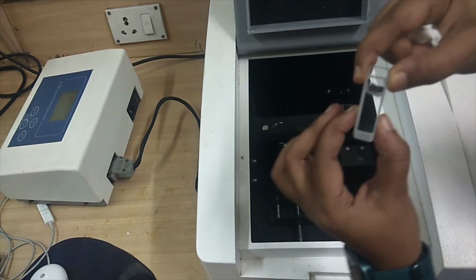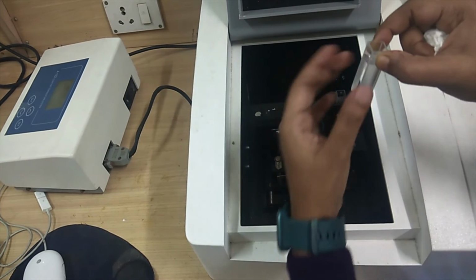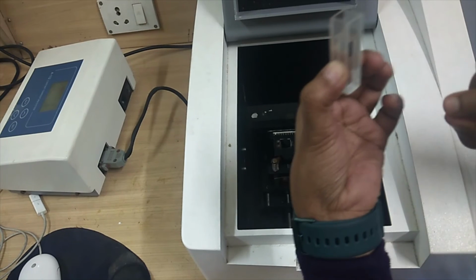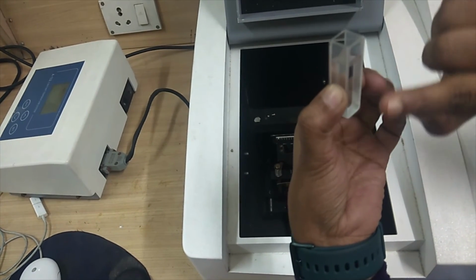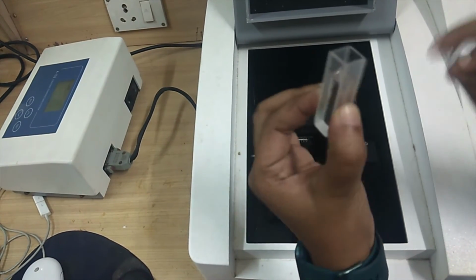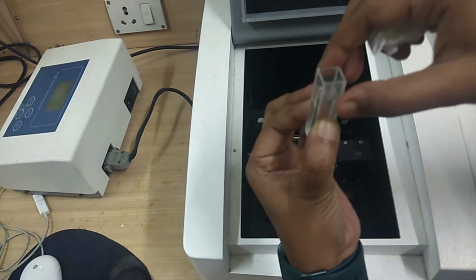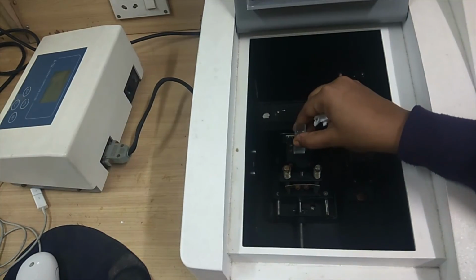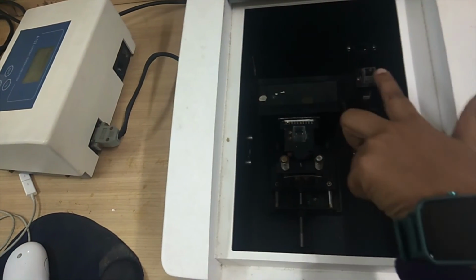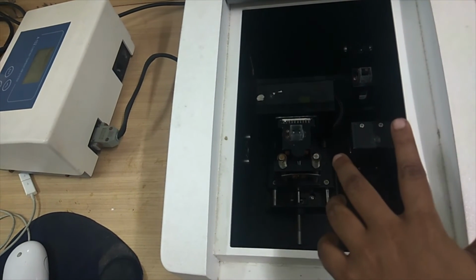Similarly, in this slot the light comes in this direction. As I said in my tutorial video also, we should avoid any kind of dirt or fingerprint on the transparent side from where the light is entering. So before placing the cuvette, we will wipe the transparent part of the cuvette and then place it inside. Right now we have two cuvettes of our distilled water, which is our blank sample.